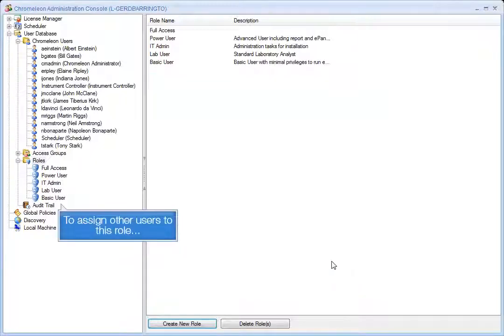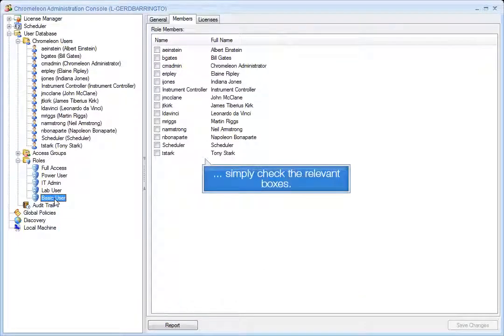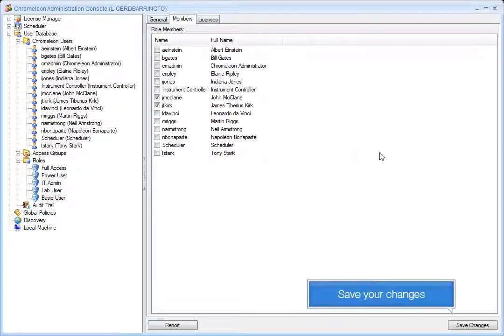To assign other users to this role, simply check the relevant boxes. Save your changes.